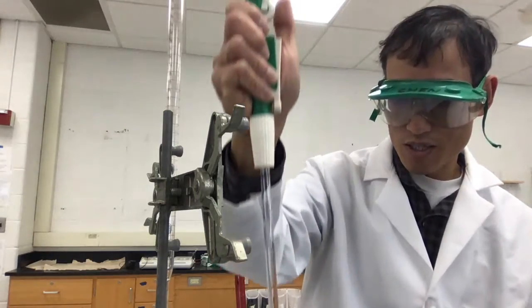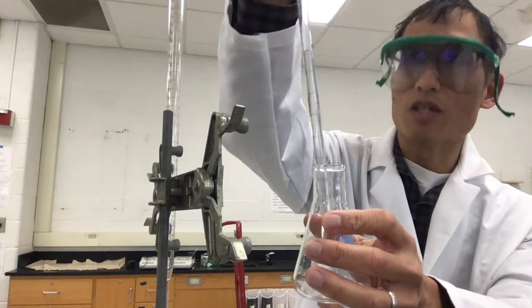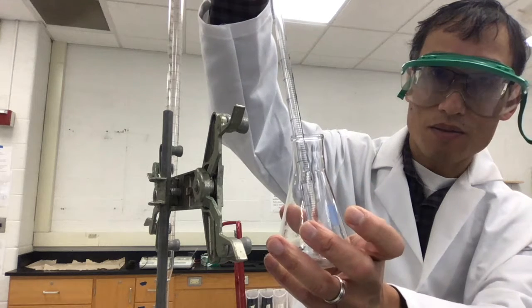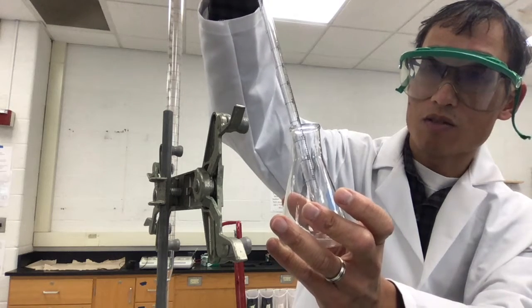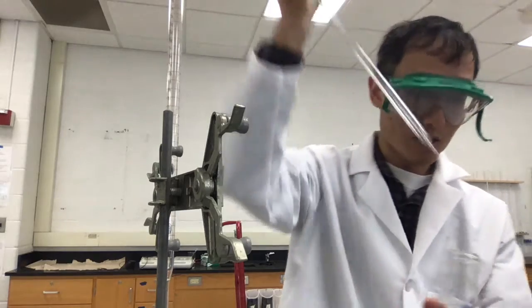And then we're going to put it into a flask. So you can just push this thing to let air in. And it's going to go all in there. Okay? And then we can go ahead and push the rest of it in using the little spinner thing. Make sure that all gets in there.